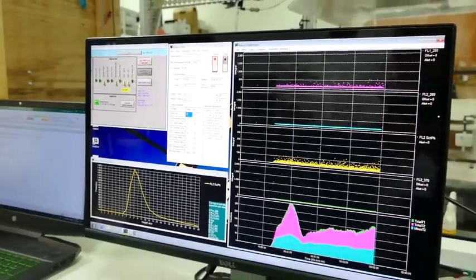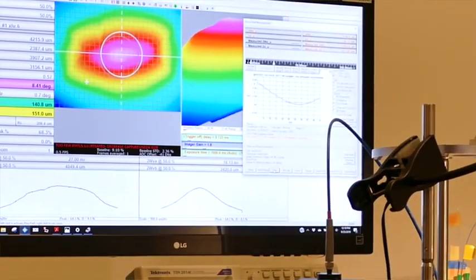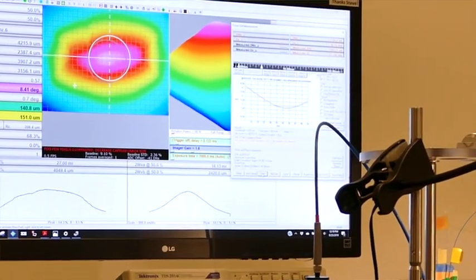The difference here is this has other lamps in there that illuminate or induce fluorescence, and biology has a very specific type of fluorescence. This has extra lights in it that laser particle counters don't have, and that gives it the ability to separate biological particles from not.